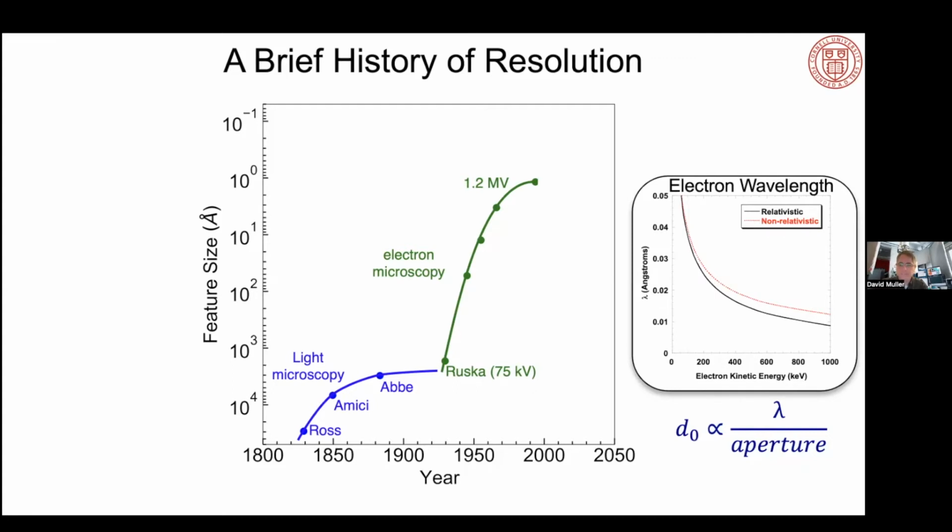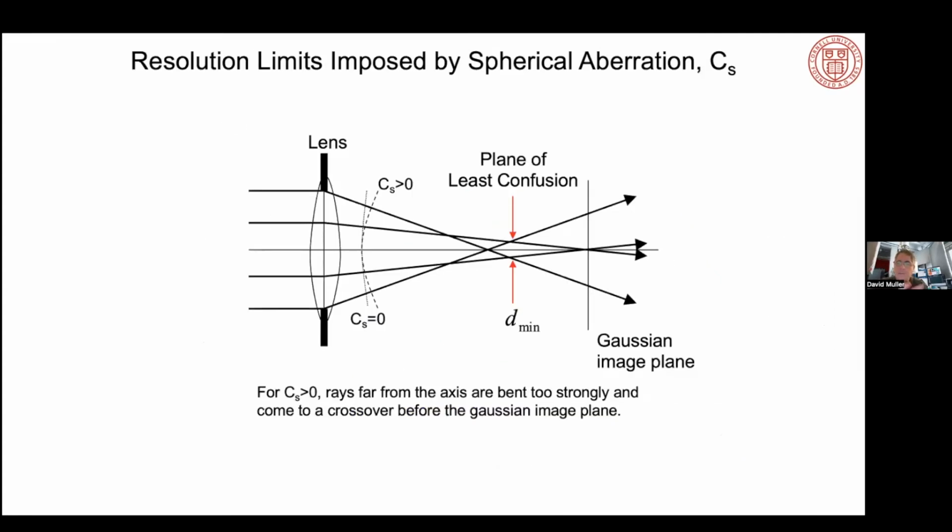The problem, of course, is that the lenses have terrible spherical aberration and terrible chromatic aberration. So one of the reasons we obsess about these very narrow energy spreads is if they get any worse than that, it's the resolution limiting aberration for a microscope. On a synchrotron, 1 part in 10 to the 4, 1 part in 10 to the 5, that might be typical. If we were 1 part in 10 to the 5, my spatial resolution would probably be about 10 or 20 nanometers.